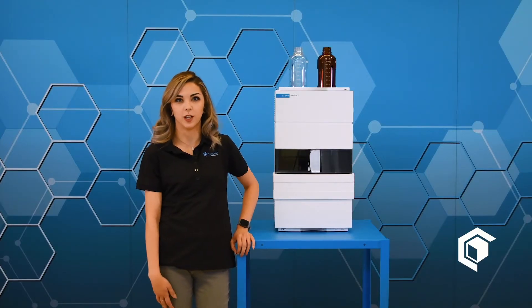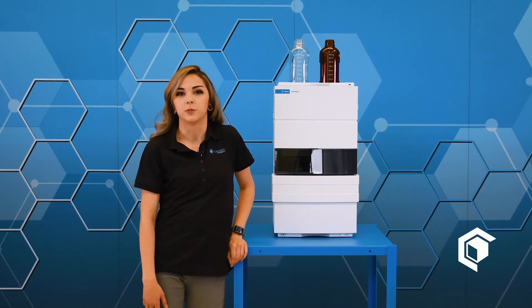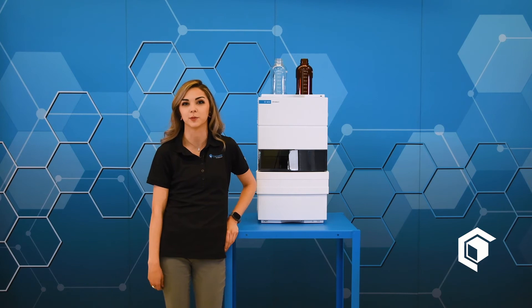The Agilent 1220 is a useful tool to help optimize your workflow. The 1220 can be used during your cultivation process to help determine when the best time is to actually harvest your plant material. It could also be used in the extraction process to help determine your extraction efficiency, and it can test to see if your sample is properly decarbed to avoid wasting product.